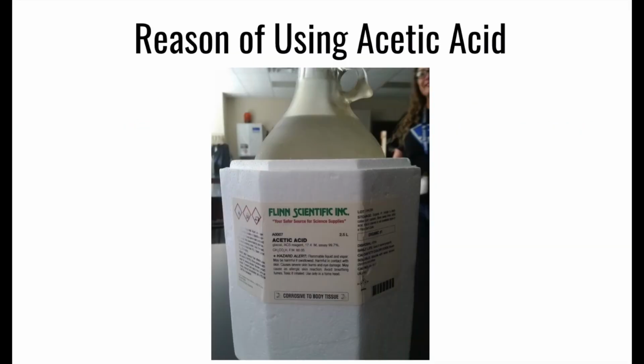In this lab, we use acetic acid as opposed to hydrofluoric acid. This is due to hydrofluoric acid being extremely toxic and having the ability to leave painful burns on the skin. Therefore, it was much safer to use acetic acid.